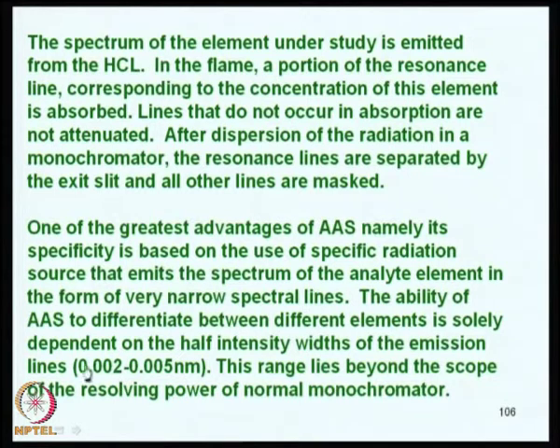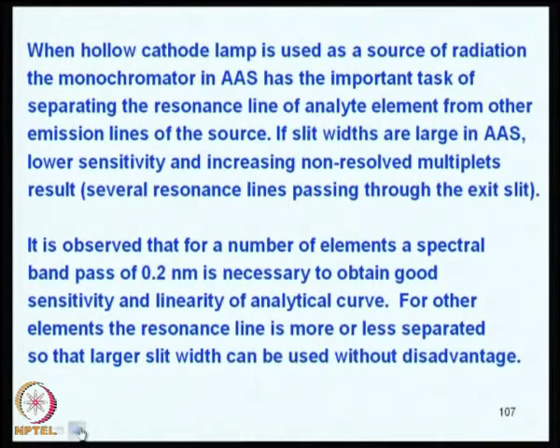What I showed you is the requirement is from 0.002 to 0.005 nanometer of spectral separation, and the instrumental requirement is about 0.2 nanometers. It is necessary to obtain good sensitivity and linearity also of the analytical curve.